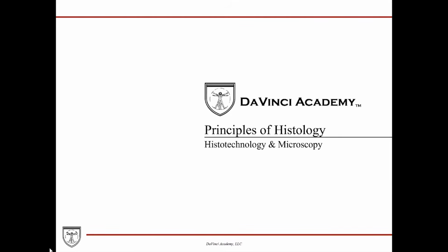Hi, I'm Dr. Lee, and welcome to Histology. This is the first of the series of histology lectures titled The Principles of Histology. Today we'll talk about what histology is and why we care about studying it, followed by discussing the two very important tools in helping us study histology. And these are histotechnology and microscopy. Let's begin.